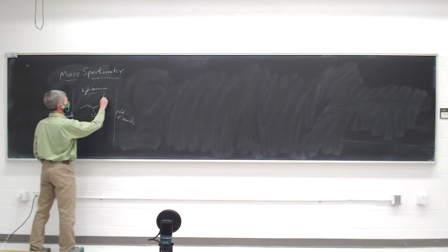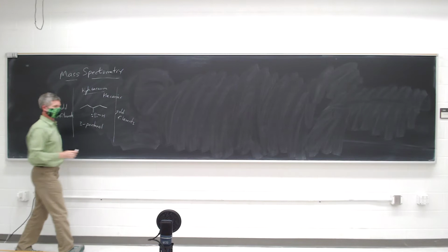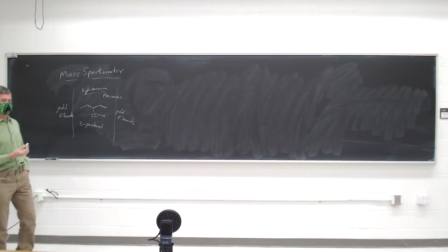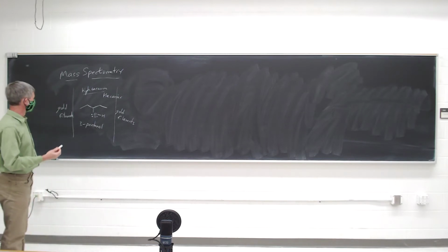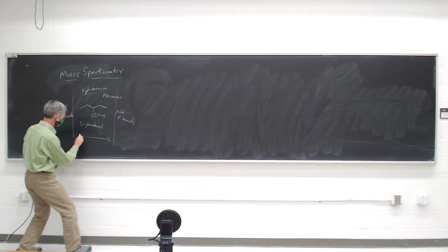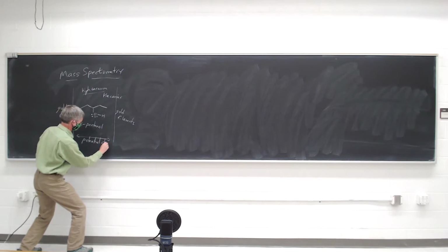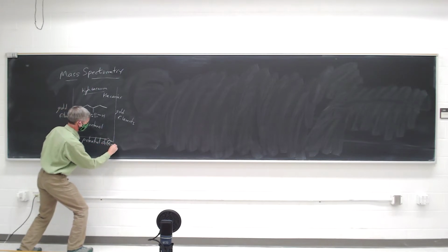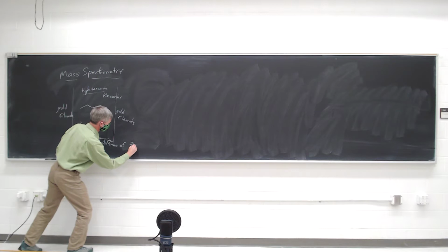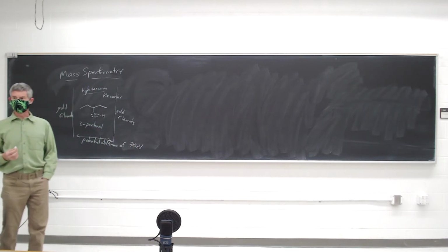And the helium carrier gas is going to be largely unaffected by what we're talking about here. So we keep these at a potential difference of around 70 electron volts, which is a pretty large potential difference.